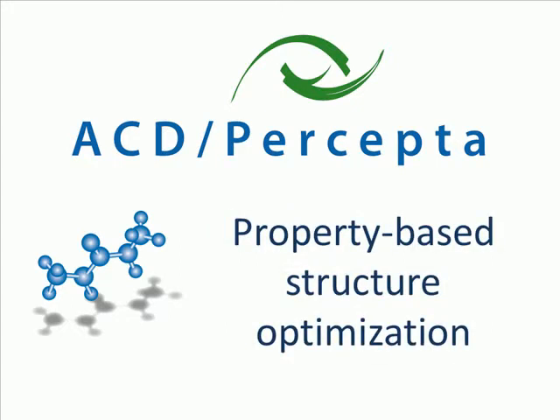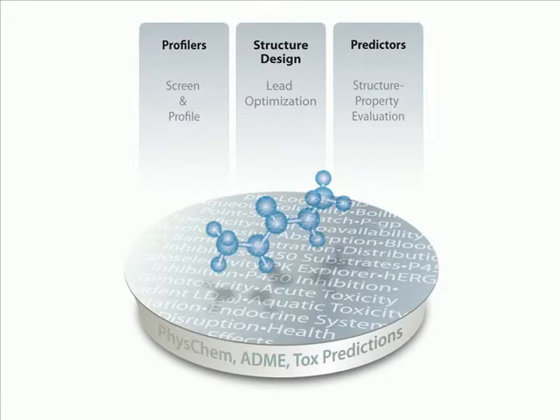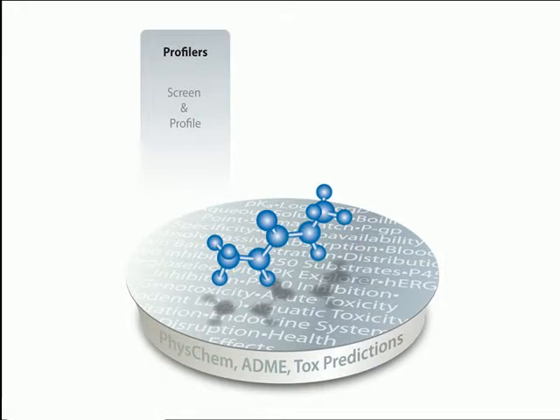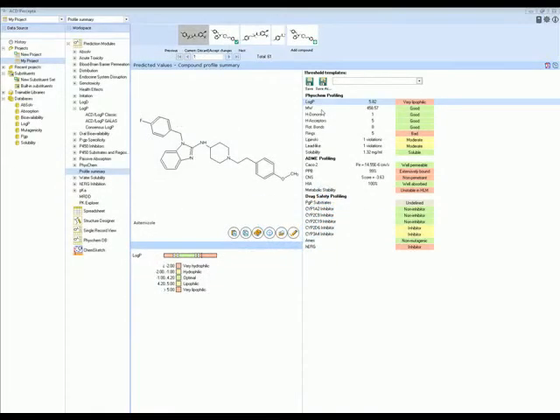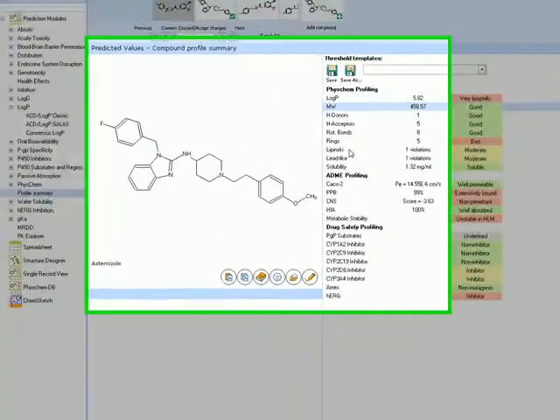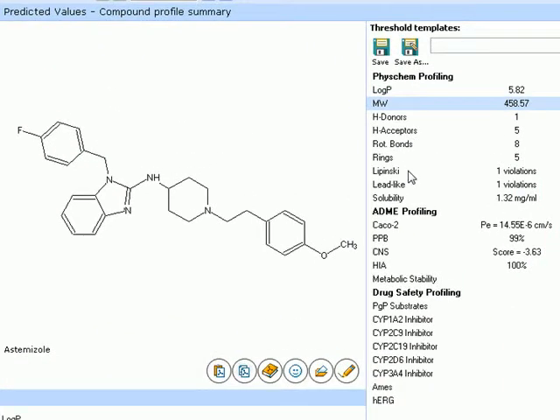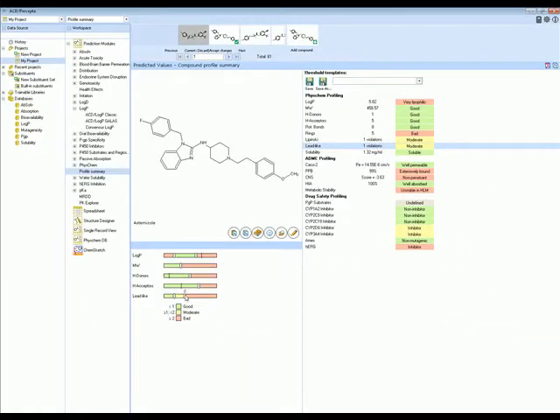The Percepta platform offers a multitude of different workspaces to meet your needs. Quickly evaluate and prioritize compounds based on their property profiles. View the full array of predicted properties, including basic physicochemical characteristics, ADME, and drug safety-related properties. Predict full profiles for one or thousands of compounds with ease.